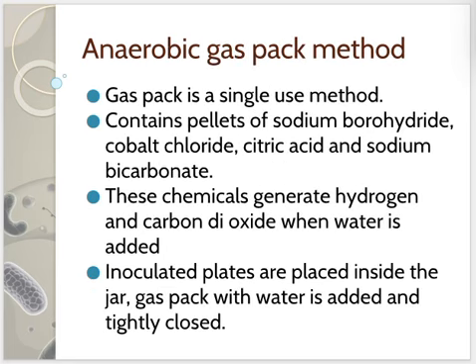It uses chemical pellets that generate hydrogen and carbon dioxide when water is added. Inoculated plates are placed inside a jar with the gas pack and sealed tightly. This setup creates an anaerobic atmosphere ideal for growing oxygen-sensitive bacteria.